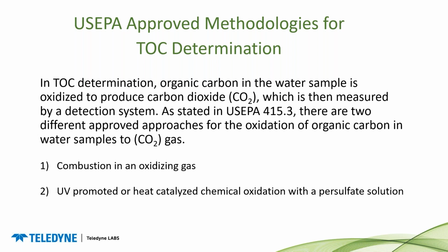In TOC determination, organic carbon in the water is oxidized to produce CO2, which is then measured by an infrared detection system. As stated in method 415.3, there are two different approved approaches for the oxidation of organic carbon in water samples. The first one is combustion in an oxidizing gas, and then there's UV promoted or heat catalyzed chemical oxidation with a persulfate solution. Teledyne Labs offers products for both methodologies.